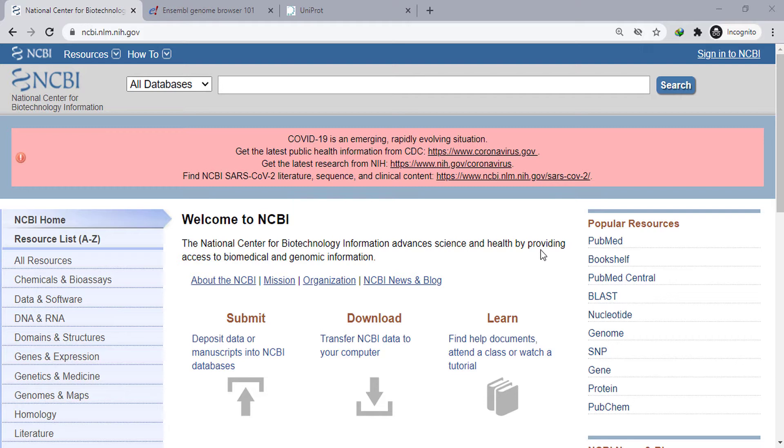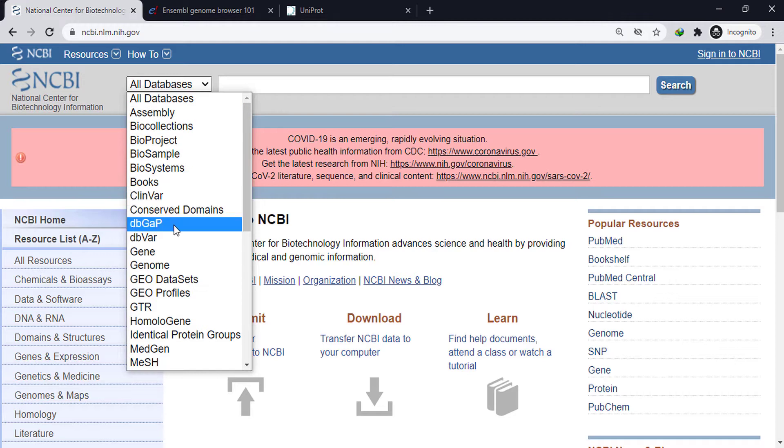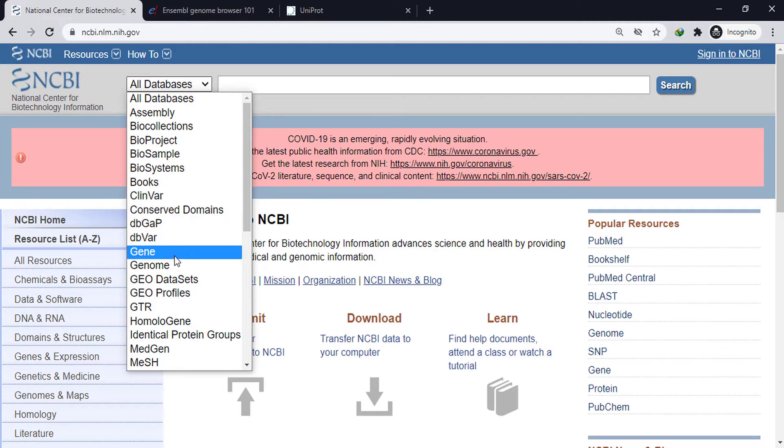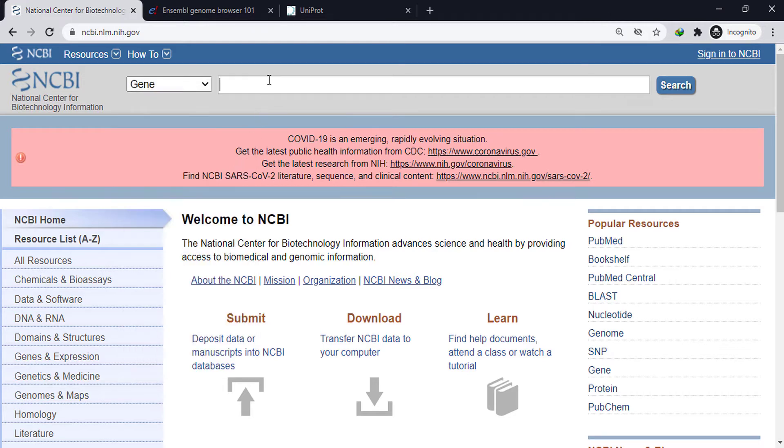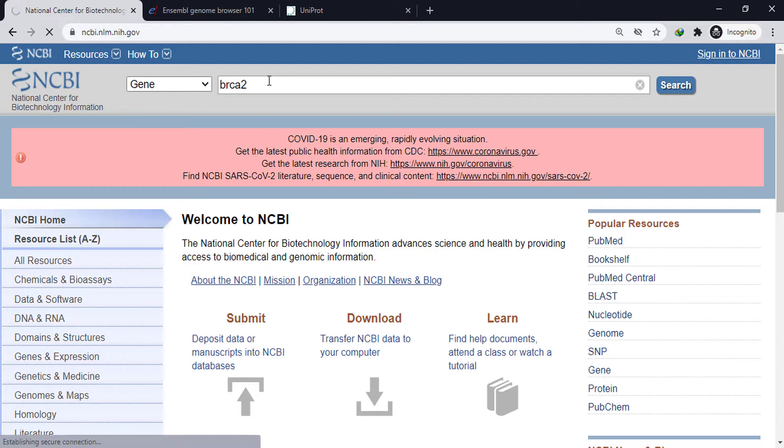To construct a phylogenetic tree, mostly DNA or protein is used. To get a DNA or gene sequence, we can get it from NCBI, from the gene database. We can search for any gene we want, such as BRCA2 or one for homo sapiens.